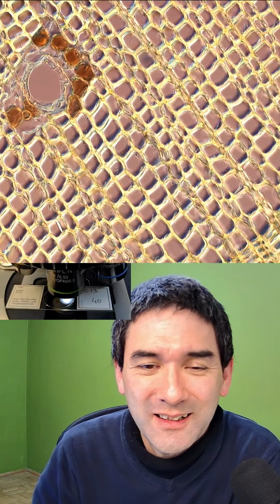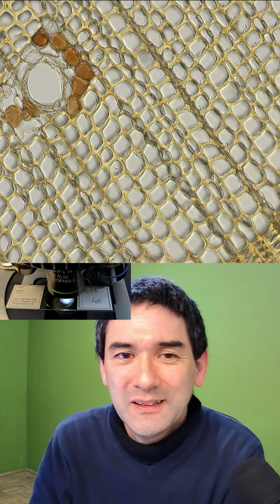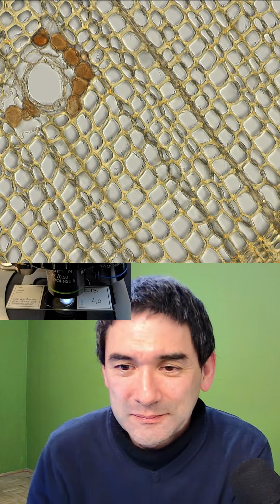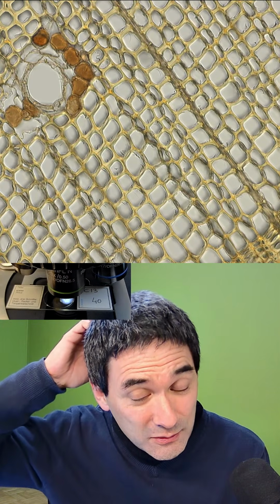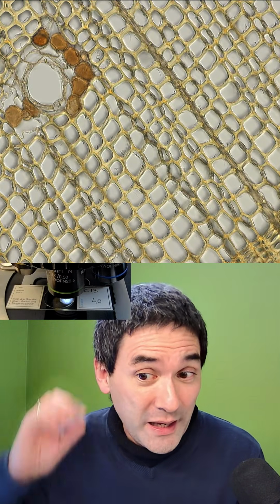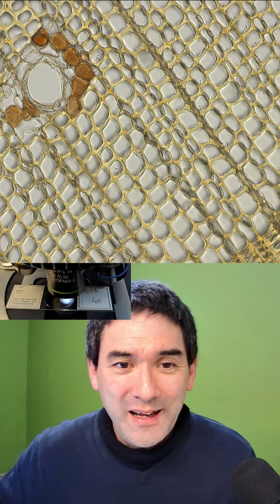So again, the individual cells here, and regular bright field. You see how much light it takes away? Yeah, it looks like this. Wow, you've got 1,000 slides, really? Honestly, that's way more than what I have. Seriously, that's way more than I have.